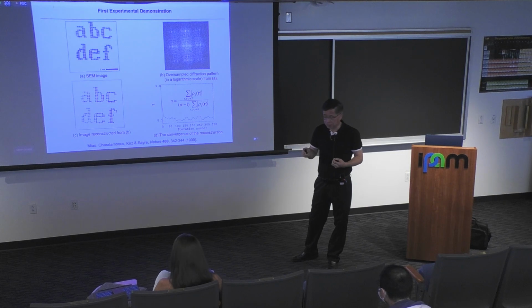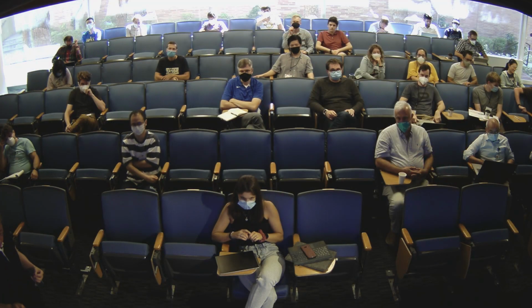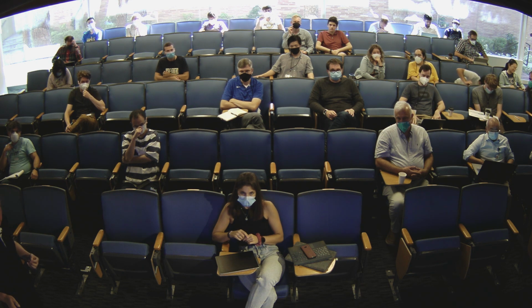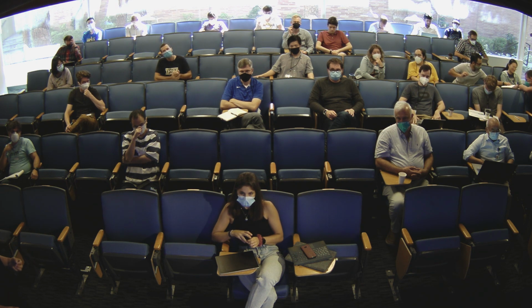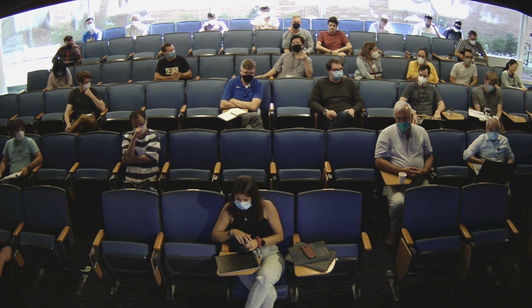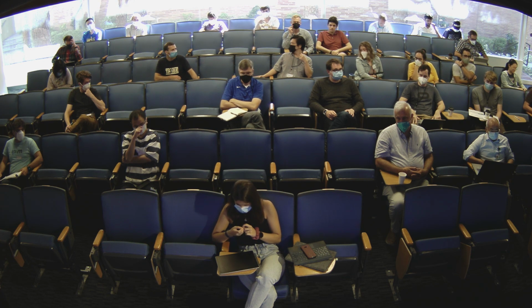But what I mean with these images here on the left side, A and C, and on the next slide, all of these 4 images, you plot by performing a Fourier transform. It doesn't matter whether it's DFT or FFT, FFT is a discrete Fourier transform too, right?